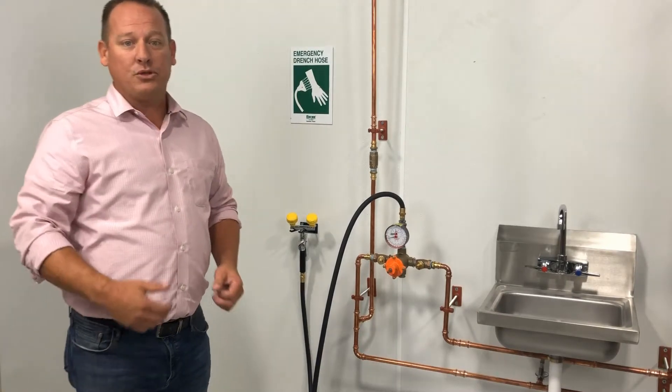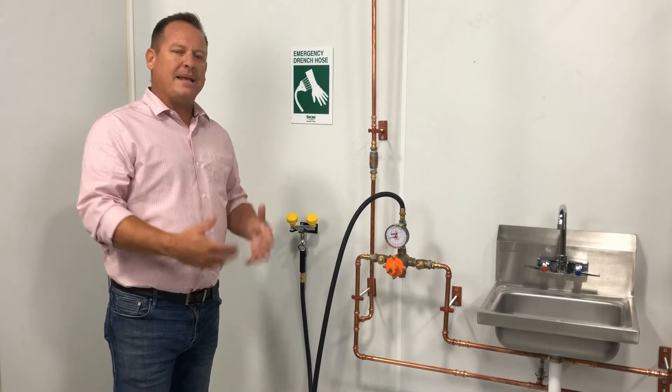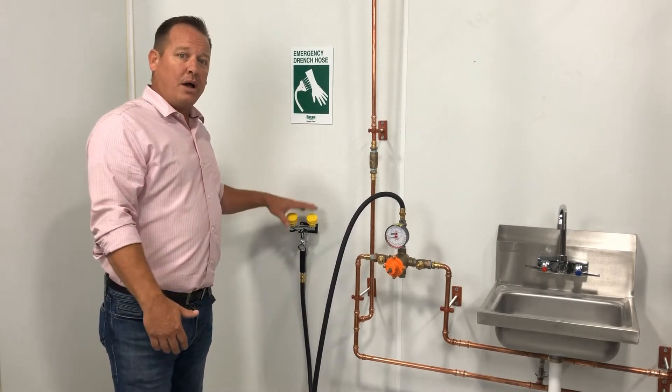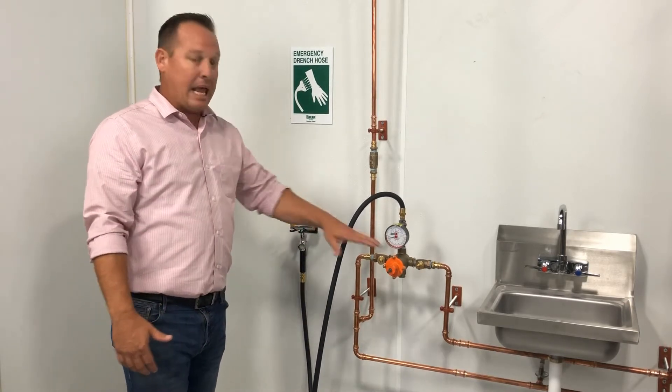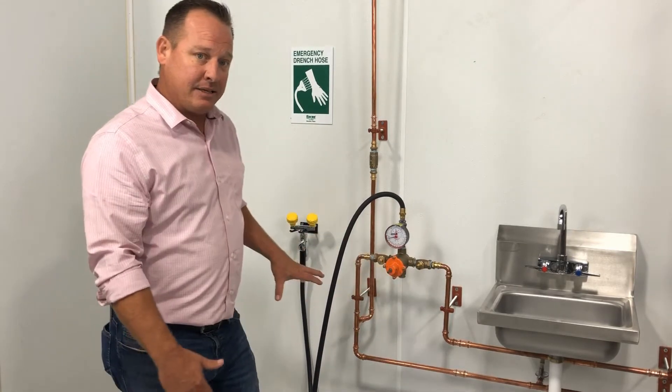Hello everyone, I'm Todd Schneider. Welcome to Water Tech with Todd. In this episode, we're going to be going over basic installation of an eyewash and drenching hose system, an ASSE 1071 mixing valve, and then the piping and how to get to this point.